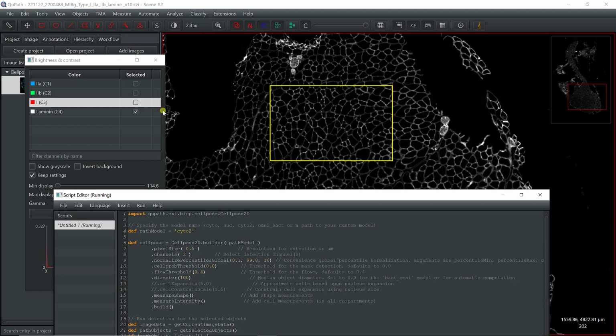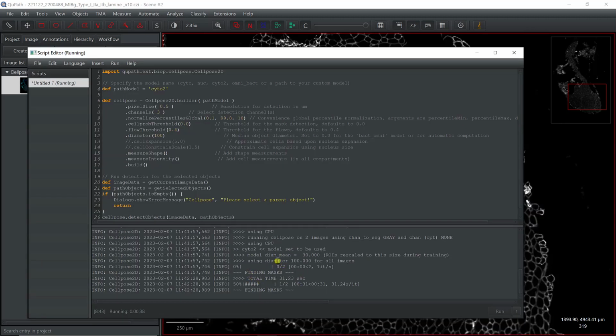We'll check it because when we run Fiji, we're going to go directly to the temporary folder where the tiles are, and run it from there. Now it's processing the second one. It's a bit long because we didn't implement the GPU version. If you want to do that, I'll show you in another video how to do it. Just going to wait.